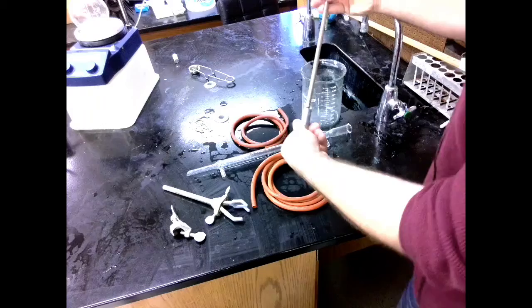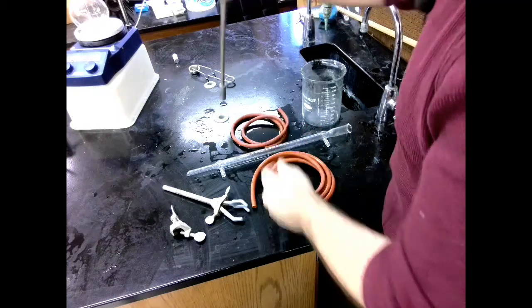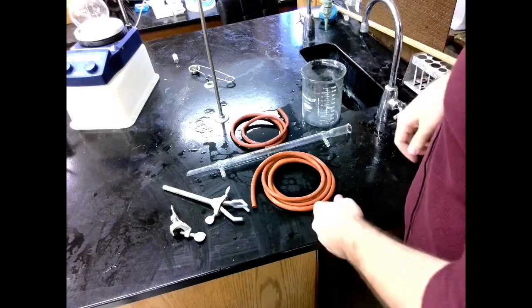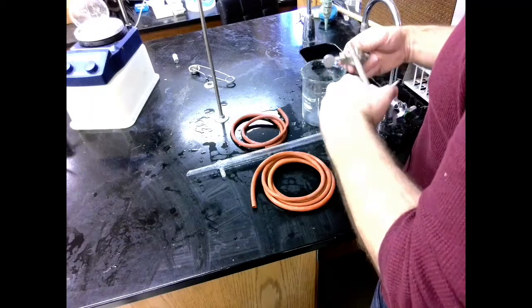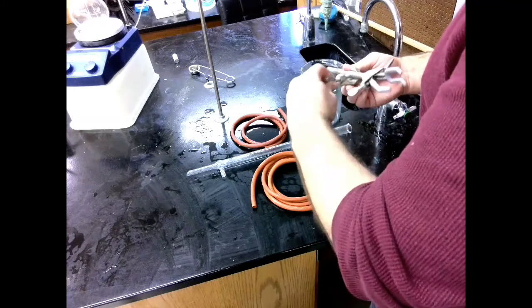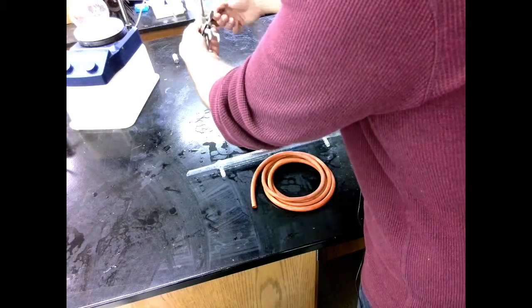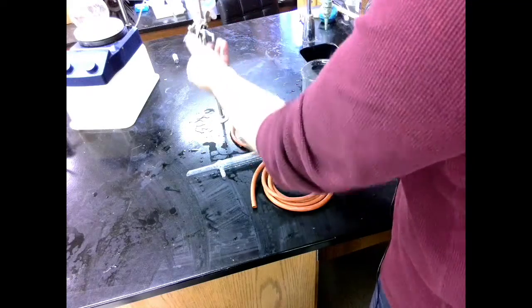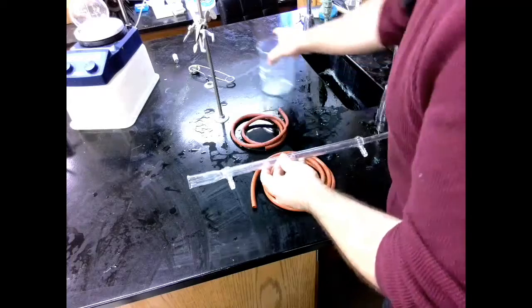And we will need an extra ring stand. So this is of the type that will just fit into our table here. The clamp will be the only thing holding the condenser up. The condenser itself will need some adjusting as you put it together. So for now we're just going to set it up at a diagonal angle. Let's move our beaker out of the way.